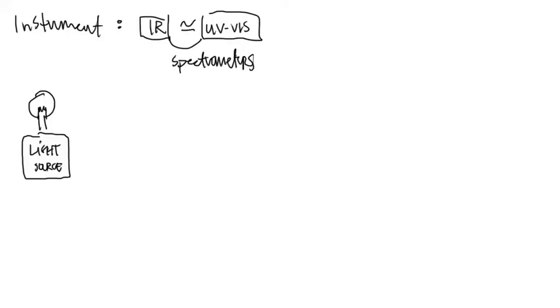Well, we're measuring in a different part of the spectrum now, so I'm probably not going to use either one of those bulbs. But we need to talk about the light source. The light source is going to go through my sample, so I'll probably have a sample compartment. That's where I would put my sample to be analyzed. UV-vis had it, infrared has it too.